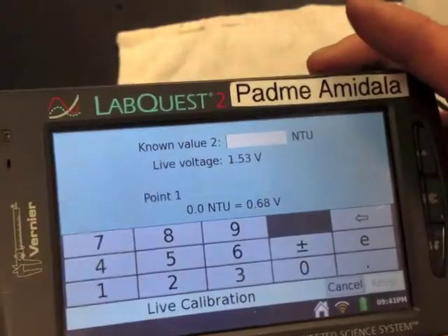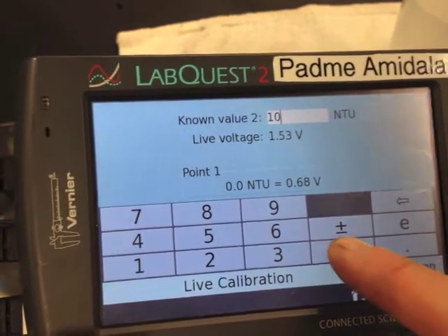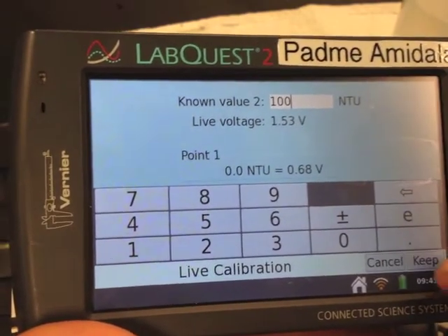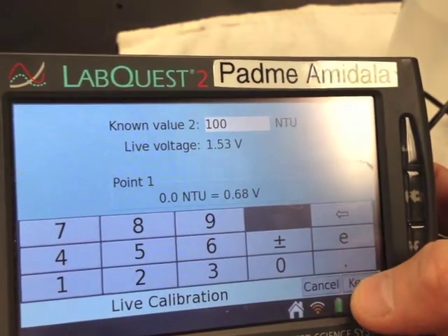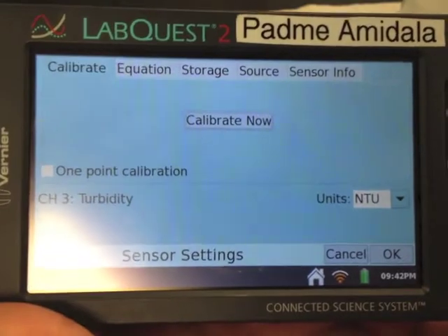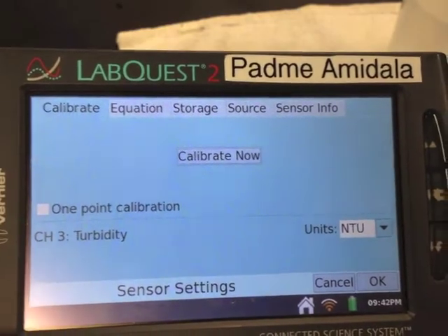Known value two is 100, so type 100 and hit keep. Don't hit calibrate now or you'll have to do everything all over again — you just calibrated it, so hit okay.